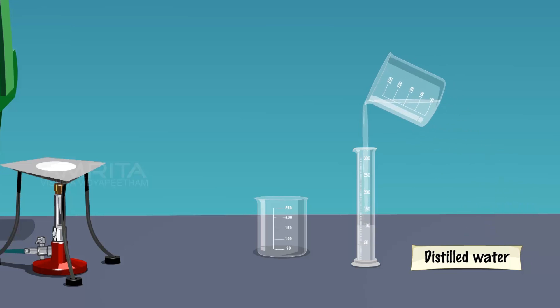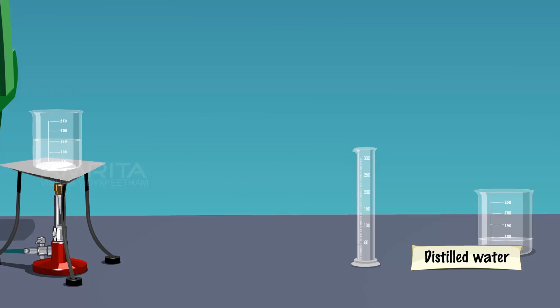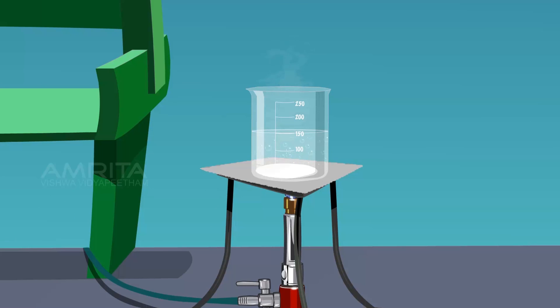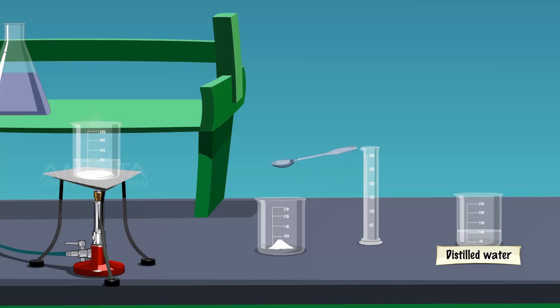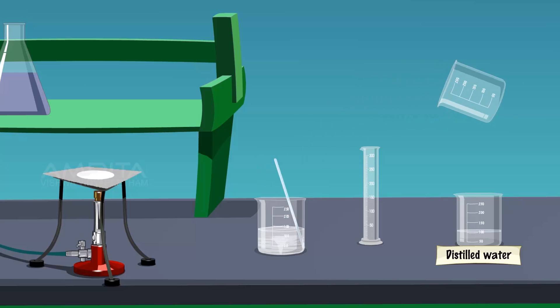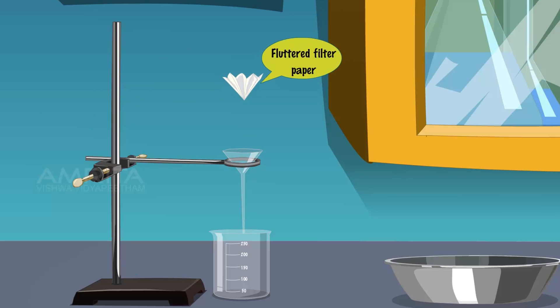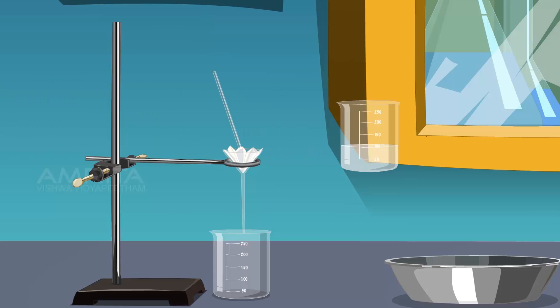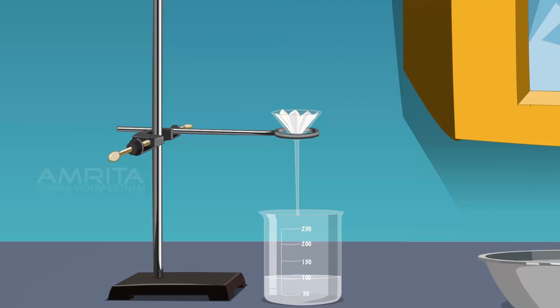Take 150 ml of distilled water in the measuring cylinder and pour it into a clean 250 ml beaker. Boil the water by placing the beaker over the Bunsen burner. Take another beaker and put some crude sample of benzoic acid into it using the spatula. Add gradually with stirring the minimum quantity of boiling water just sufficient to dissolve the benzoic acid. Fix the funnel to the stand; the stem of the funnel should touch the wall of the beaker to avoid splashing. Place the filter paper in the funnel, pour the solution through the glass rod, and collect the filtrate. The insoluble impurities are left behind on the filter paper.